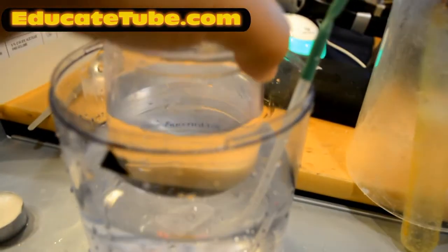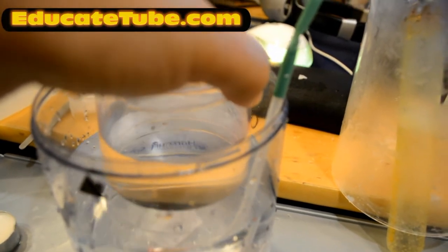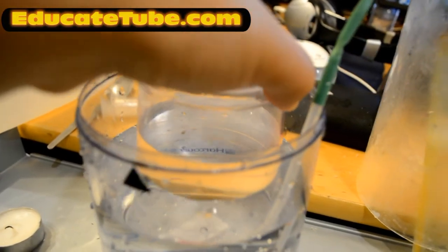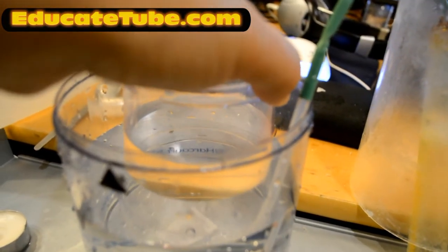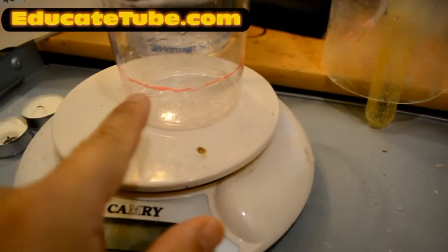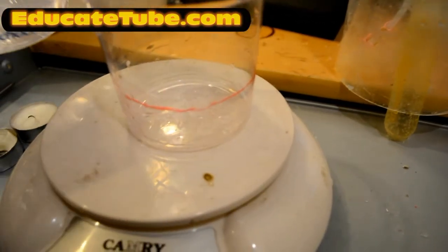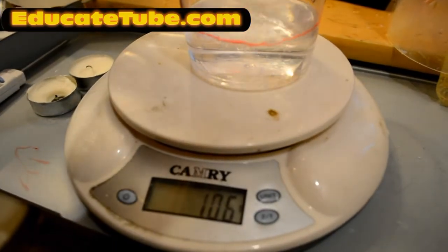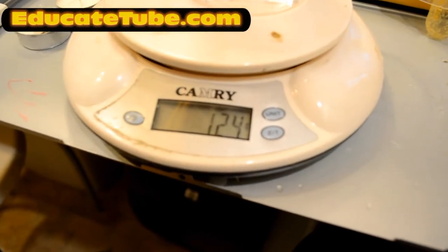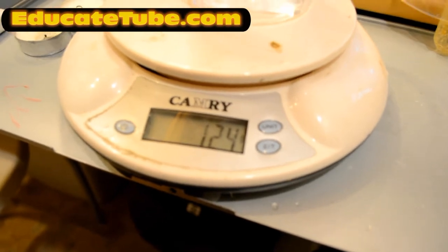Okay, you can see there's a lot of gas produced, but I don't think it's 290 milliliter. Probably definitely less than that. Looks like 150 to me. But anyway, I'm going to mark it and then I'm going to measure it. Right. Okay, so I'm going to pour the water up to here. That will tell me how much volume of gas is produced. Okay, so we only got 124 milliliter.